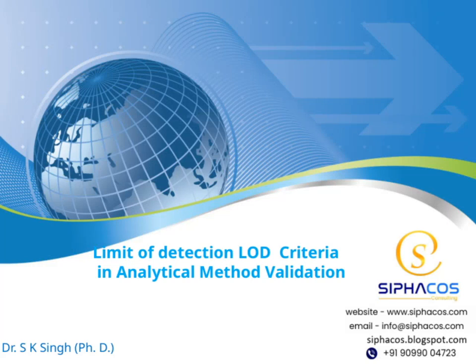I'm pleased to welcome you to this presentation on limit of detection, LOD, criteria in analytical method validation. I'm Dr. S.K. Singh, and I'll be guiding you through this session. Today, we'll explore the key concepts behind determining the limit of detection and how it fits into the broader process of validating analytical methods. So, let's get started and delve into this important topic.